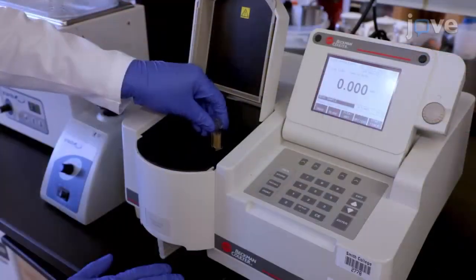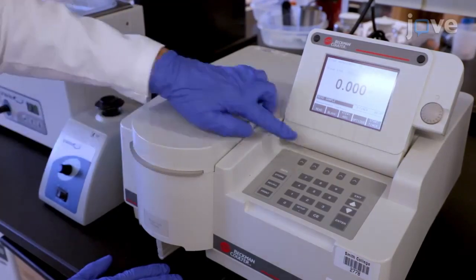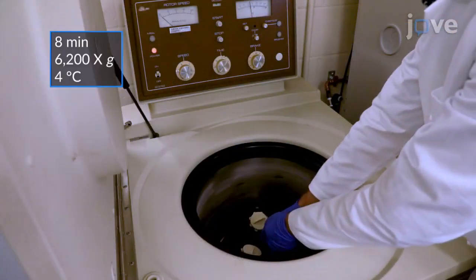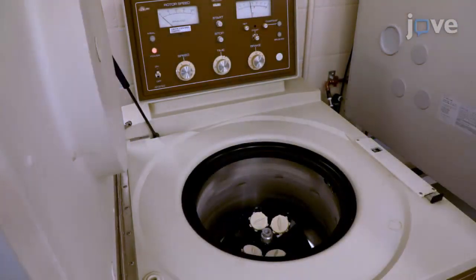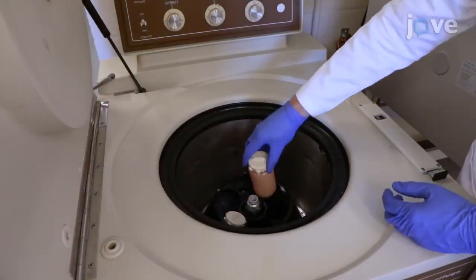On day four of culture when the optical density at 600 nanometers is between 1.5 and 2, collect the yeast cells by centrifugation and resuspend the pellet in water to wash them and consolidate the cells in a single bottle.